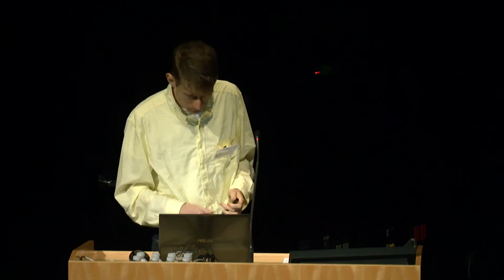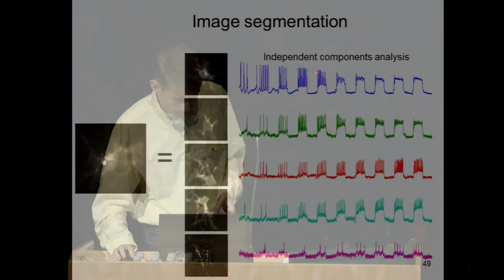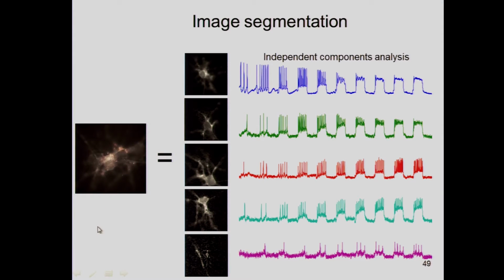So we wanted to see if we could reproduce that optically. The work to figure out this phenotype originally had been done by manual patch clamp, and it took about 2 years of manual patch clamp to get this data. So we culture these cells and stimulate them with light and record their flashes. So here's what the raw data looks like.